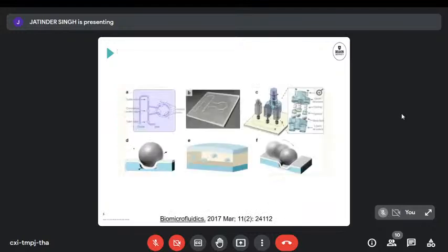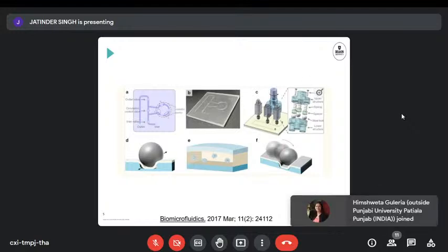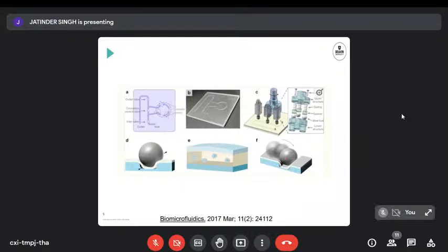But if we go to the microfluidic format, this looks a little bit different. And here we've got a first example for mechanical lysis on a microfluidic format, and that is using magnetic marbles or metal balls to mechanically squash the cells. So using a spring-loaded system here, these balls are shot like bullets towards a microchannel that contains the cell, like we've seen with the valving membrane. The top of the microchannel here deforms, and the impact of the ball squashes the cell that sits underneath, and we've mechanically lysed this cell.